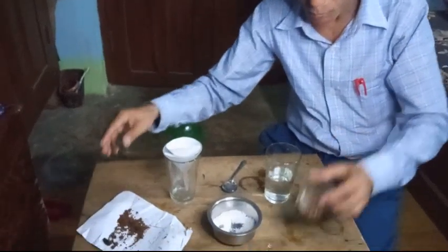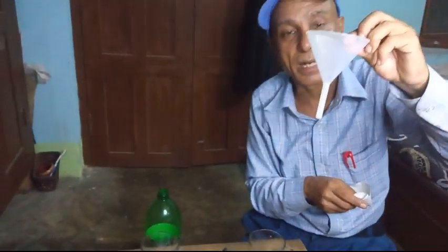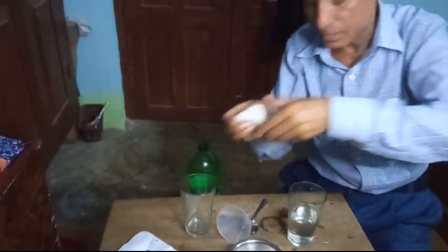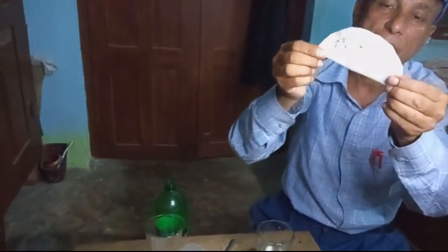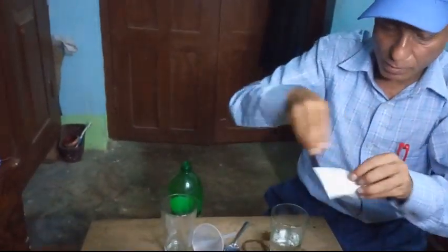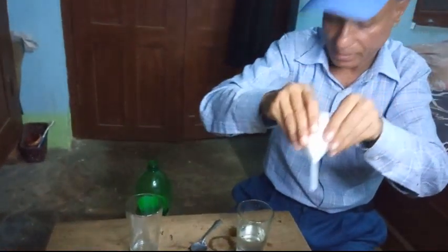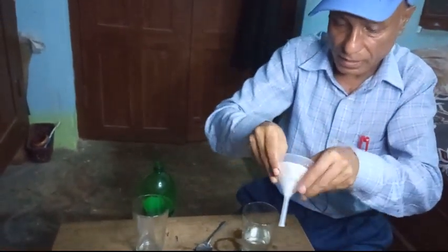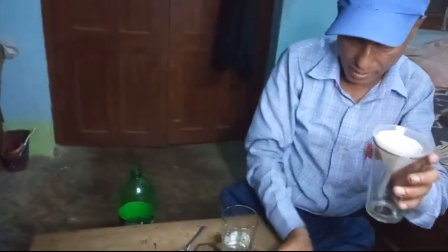Now, how to filter it? First of all, I'll show you. This is called a funnel, and this is a filter paper, round shape filter paper. Fold it in half, again a quarter fold. Now sprinkle some water and fit it tightly. Fit it tightly and keep the funnel this way.